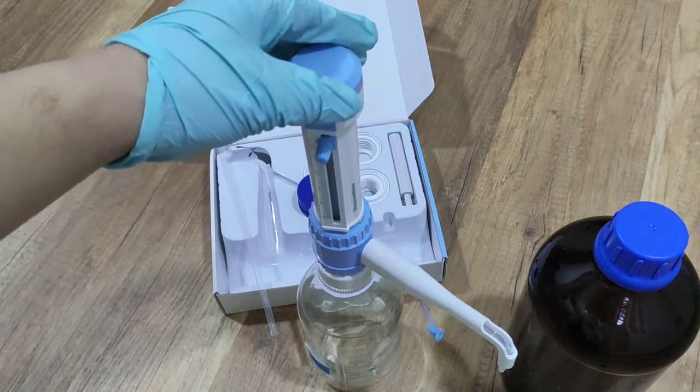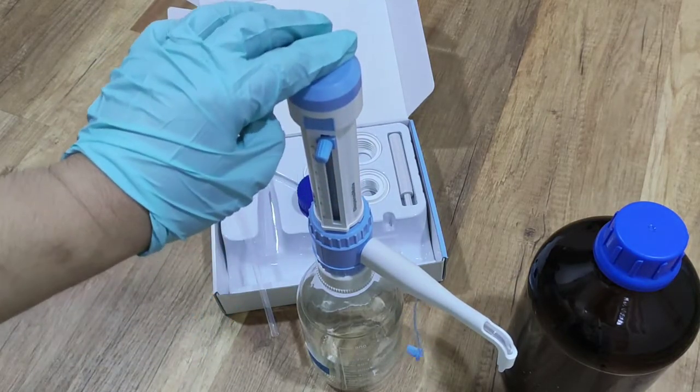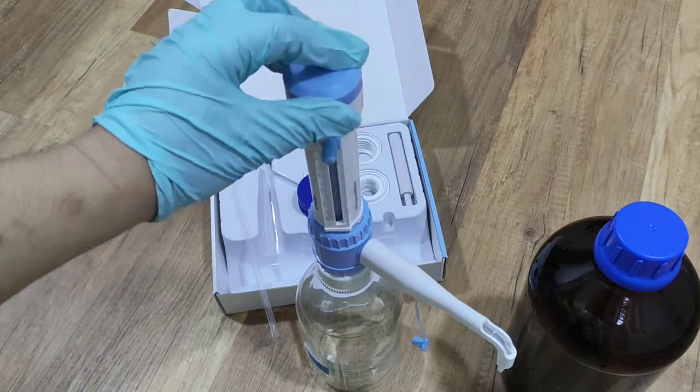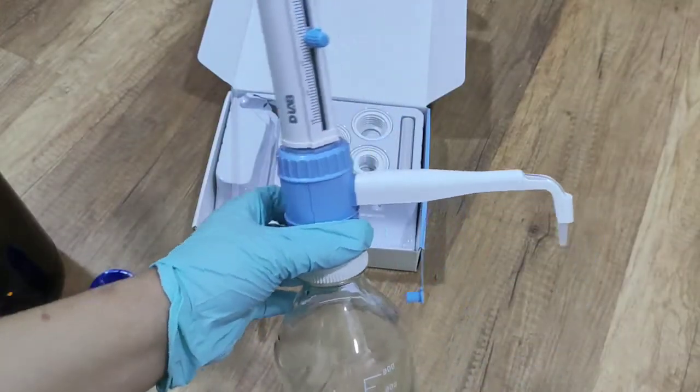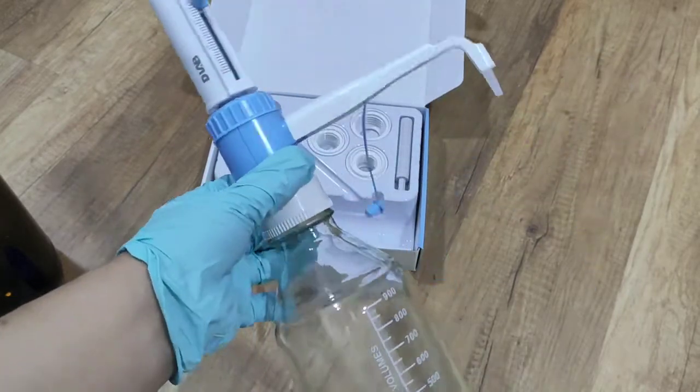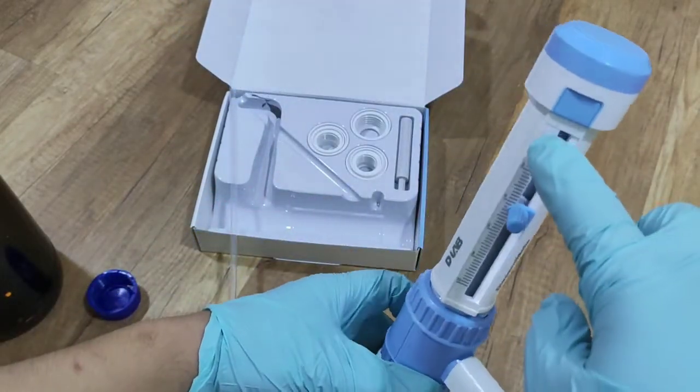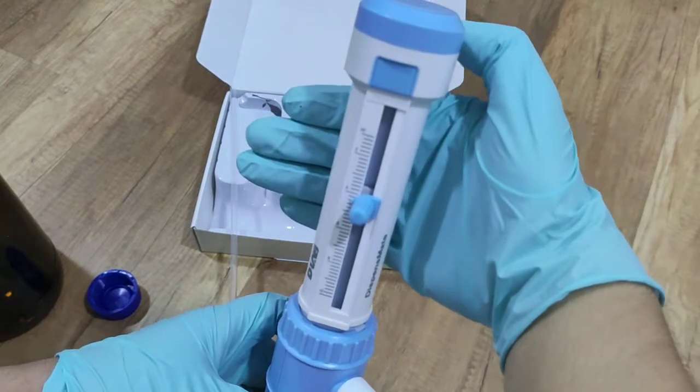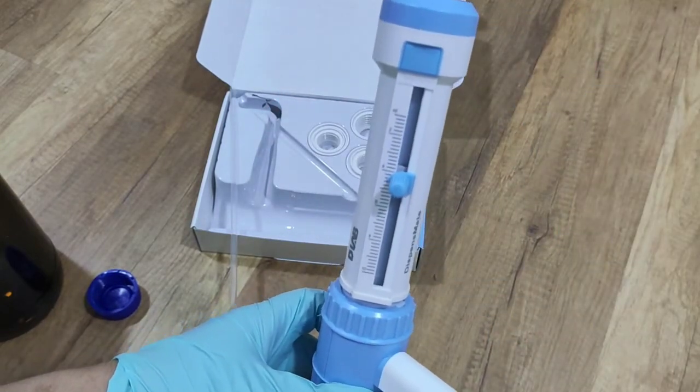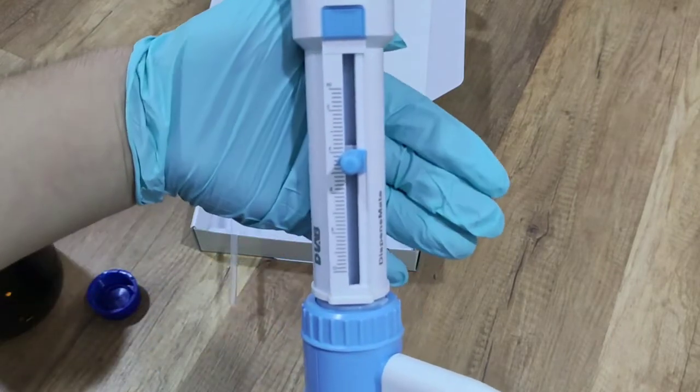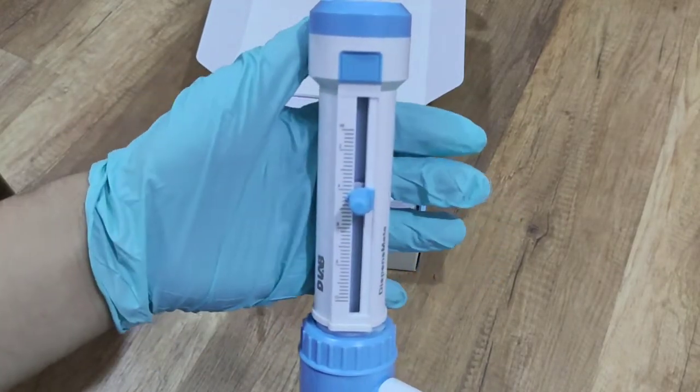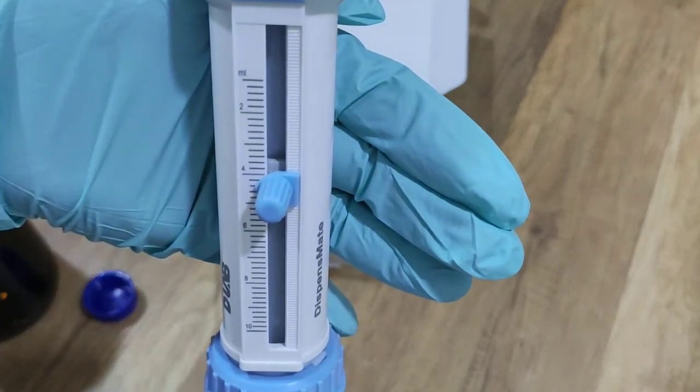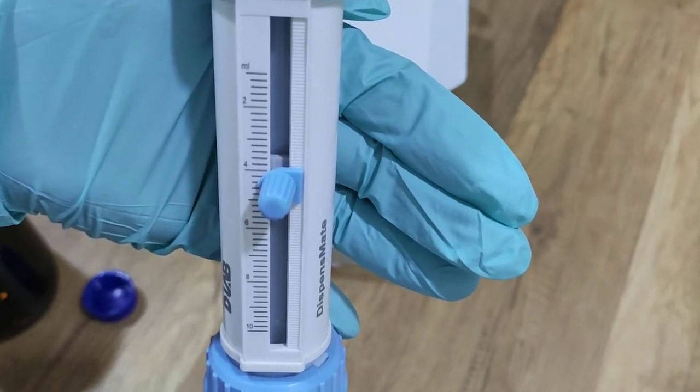And from here, we can try to set up the volume that we want. Now I'm going to show you how to use it. This is the bottle, the dispenser. And from here, we can see the volume. You can see it. I'll make it clear. You can see it. 1 ml, 2 ml, 4 ml, 6 ml, 8 ml, and 10 ml.